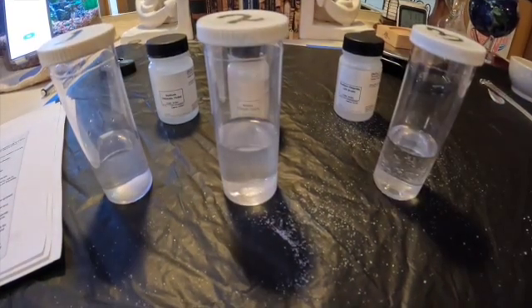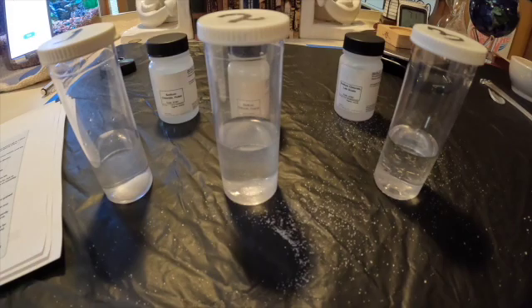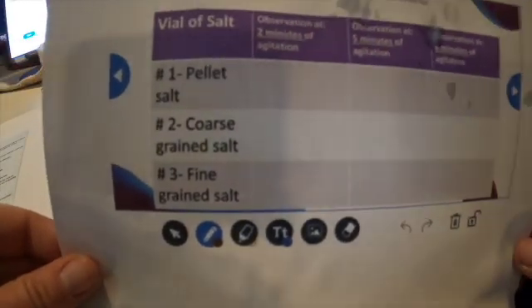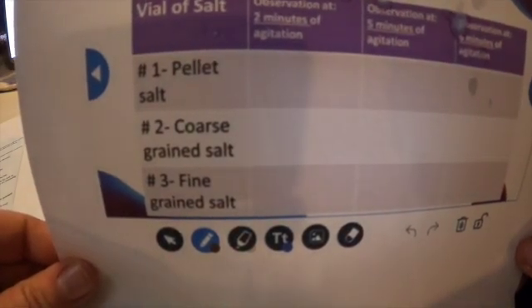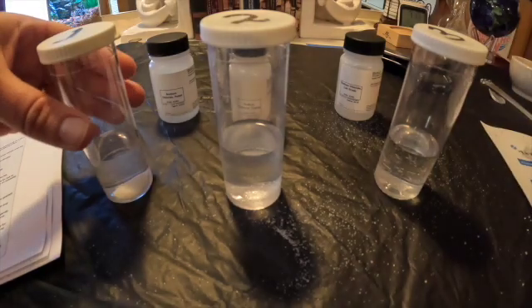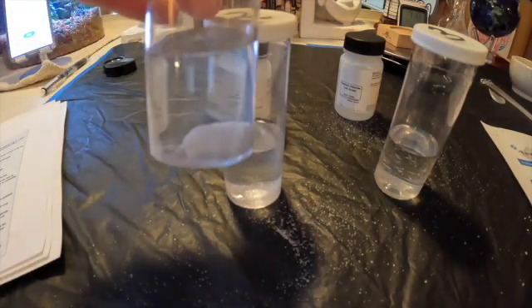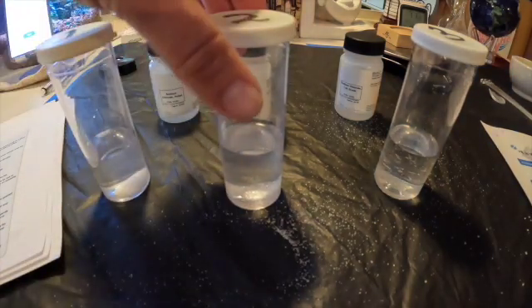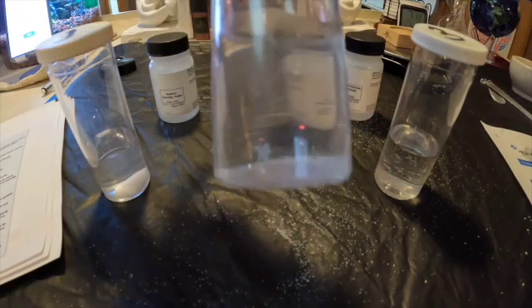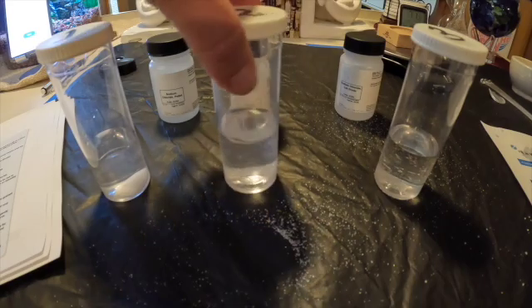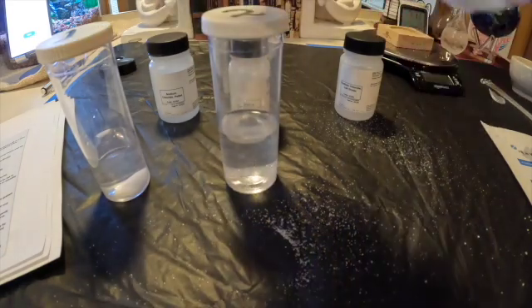It has been two minutes of agitation on the vials. We want to see our observation at two minutes, then we'll check again at five minutes and six minutes. Vial one with the pellet looks like this. Vial two with the coarse grain salt looks like this — you can still see some at the bottom. And vial three with the fine grain salt is getting pretty clear, though there is still some in the bottom.